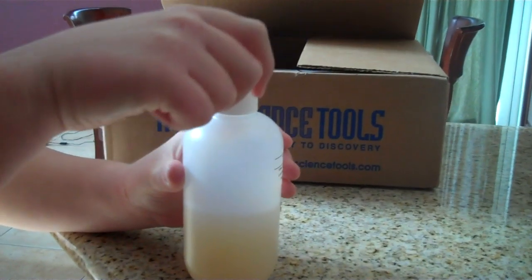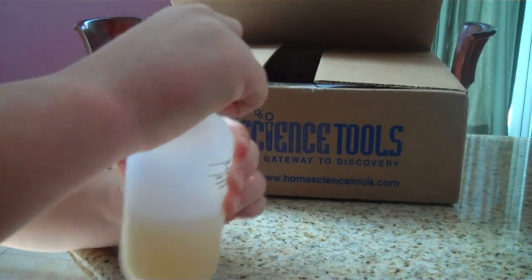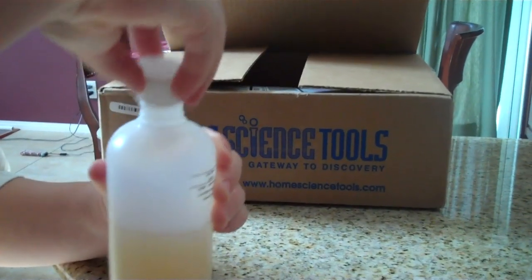Step 1: Remove the lid of the bottled agar. Step 2: Microwave the bottle of agar on high for 30 seconds.